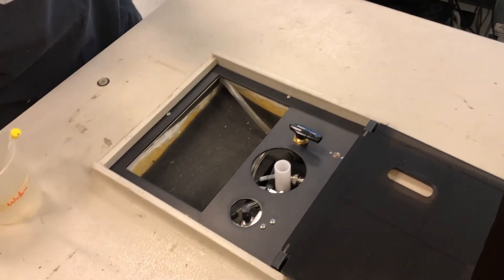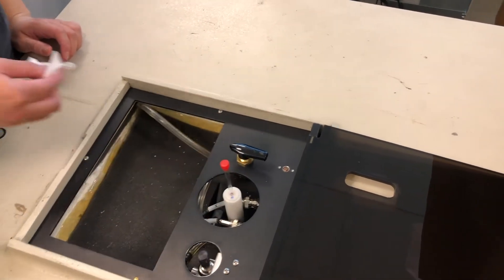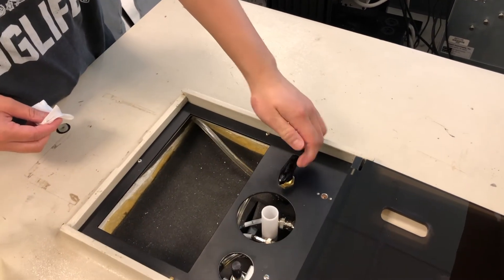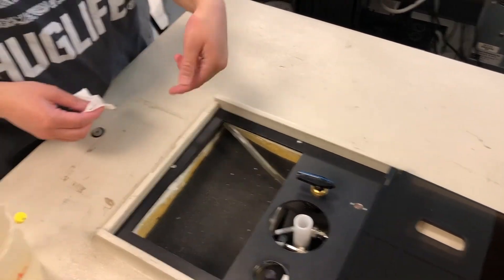Then, place your HNMR tube into where the sample tube first was. Turn the knob 90 degrees, wait for about 3 seconds, then turn it 90 degrees again. You may check with a flashlight if your tube is inside correctly and spinning.